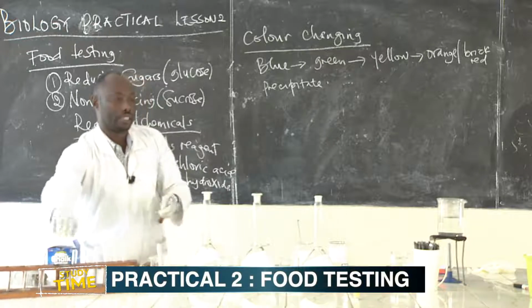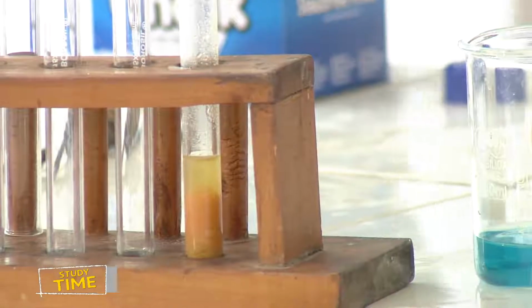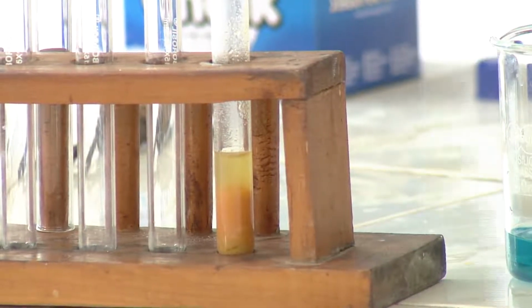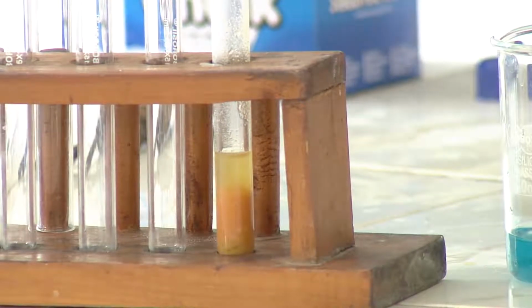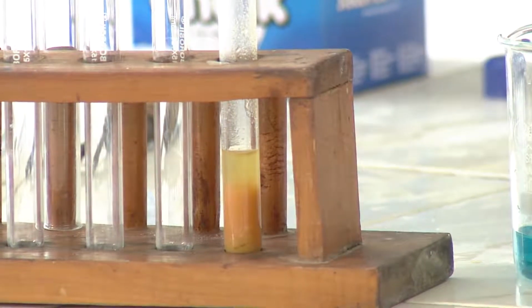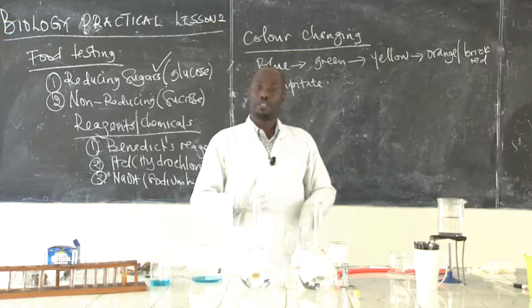The second practical: we are through with the reducing sugars. Let's talk about non-reducing sugars. For the non-reducing sugars, today we are going to use sucrose as a sample. We are going to be testing the presence of sucrose in our sample.